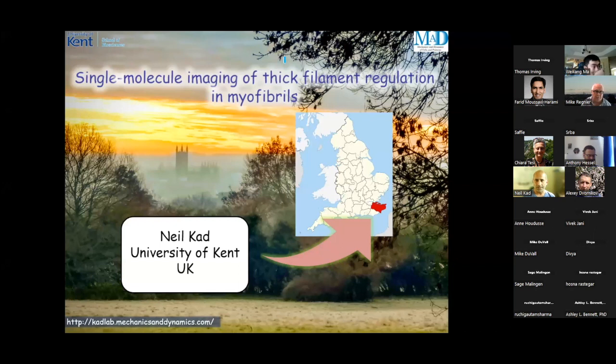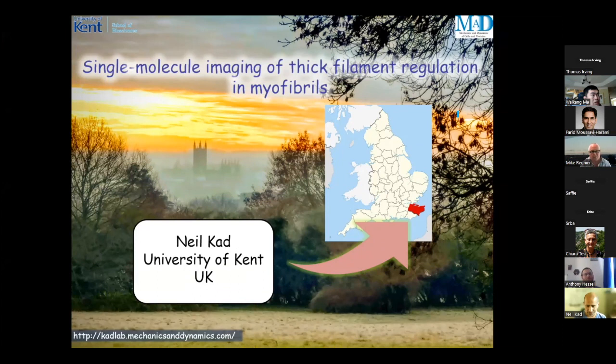So I'm going to be talking today, and I can move this away, about some of our work that we've been doing recently, and maybe this will speak to some of the questions that Safi was just fielding regarding alternative methods to look at the picture of the SRX, DRX on-off states, etc. Because we're taking a single molecule imaging approach where we're going to be looking at regulation of thick filament in myofibrils.